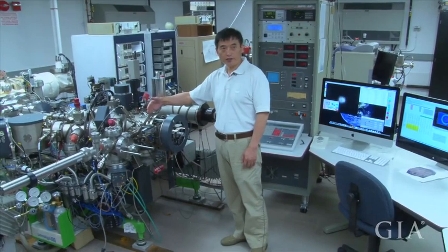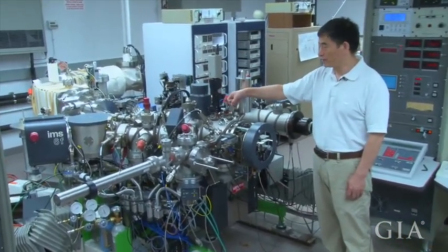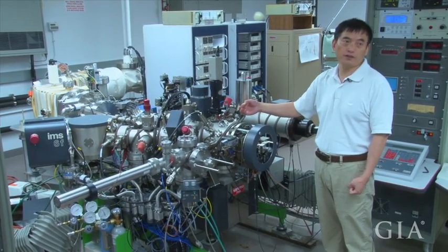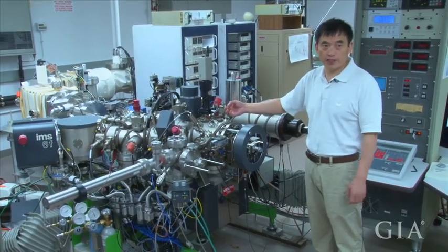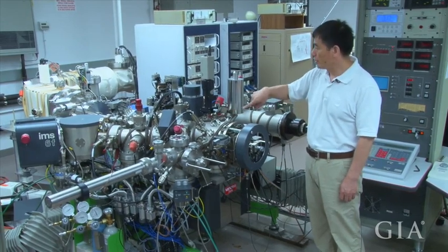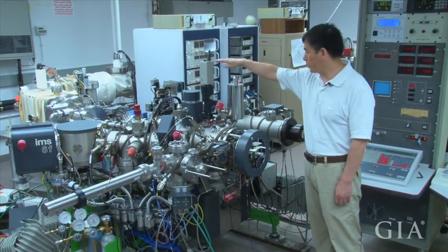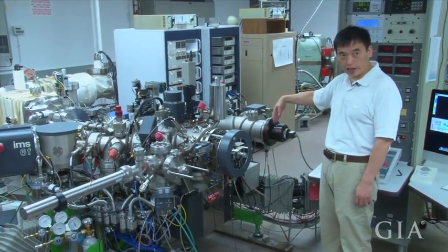The target is sitting here and the primary ion is a cesium ion. It's focused to about 15 microns and hits the sample, then the secondary ions are extracted and detected over here.